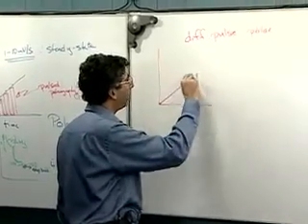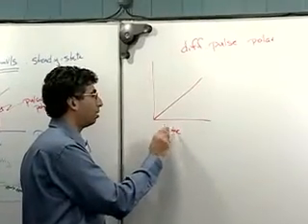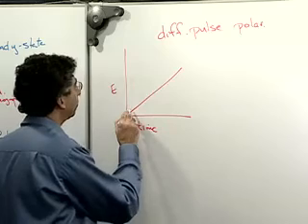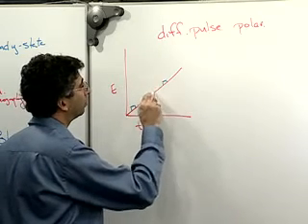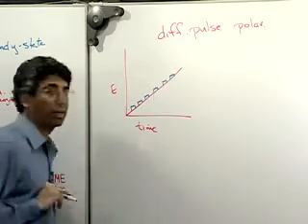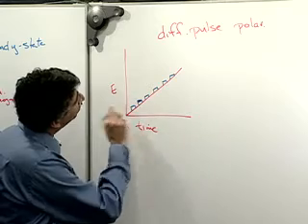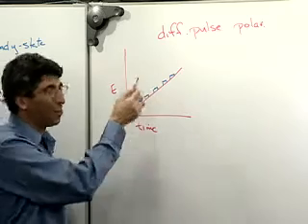Superimpose on our classic linear ramp in potential, we're going to put a little interrogating pulse. These are supposed to be evenly spaced, like this. They're parallel to the line, actually, is the way it's done.